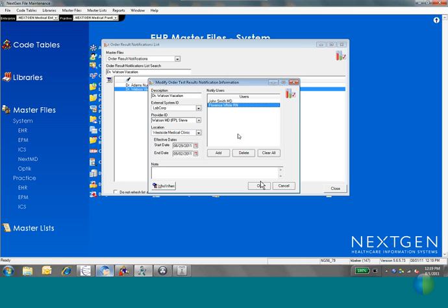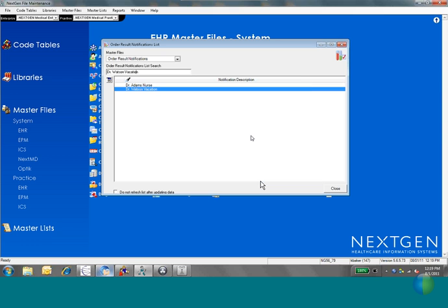Now, if you plan on using the PAQ, I highly recommend using the Workflow Manager instead. And in fact, even for tasking, I think the Workflow Manager is a little bit better. So you don't really have to do this table, but I just want you to know it's there, that you can do it for the tasking purposes. And it's specifically for labs, whereas the Workflow Manager automatically can do more than just labs.